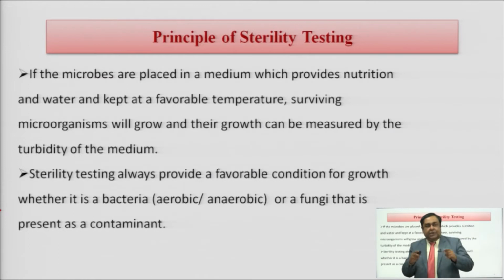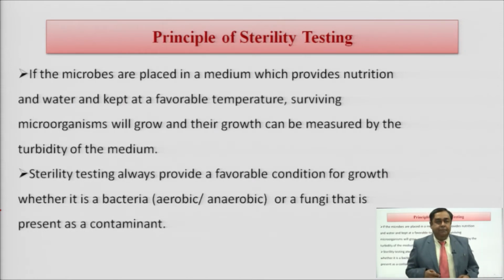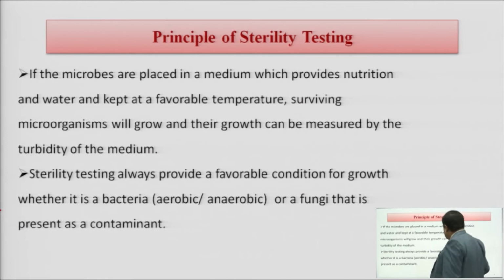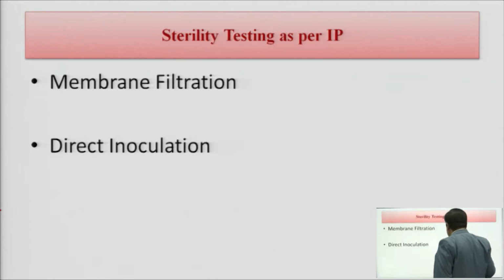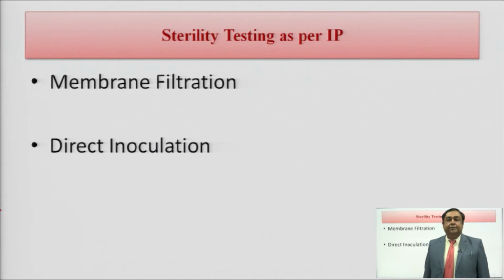Now, sterility testing is always referred to in the Indian context as per the Indian Pharmacopoeia. And there are two methods of sterility testing. One is the membrane filtration technique, which we will be studying in today's class, and the other one is the direct inoculation technique.